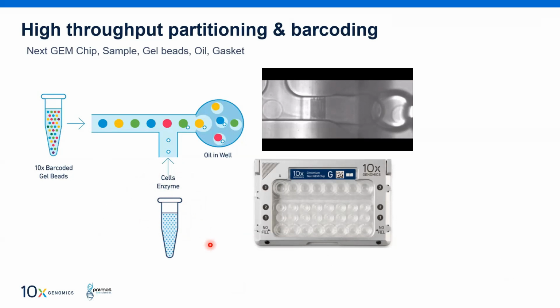All those things, we say that it should be debris free. The appropriate amount of cells has to be there for every sample. And then we prepare an enzyme mix similar to RT enzyme mix, and we add the counted cells into that particular sample. In the meantime, we have to assemble the chip on an aluminum cassette.